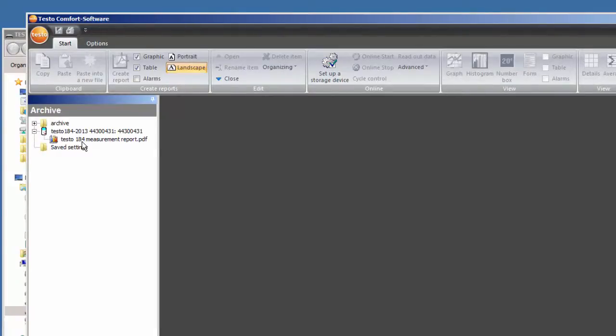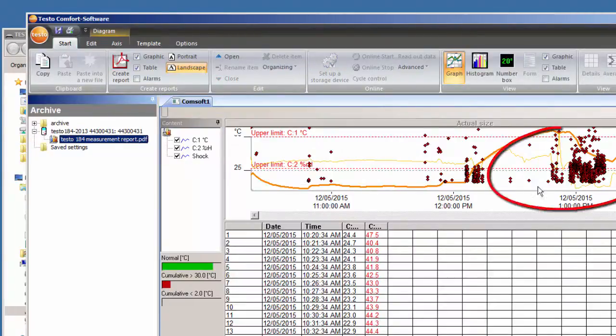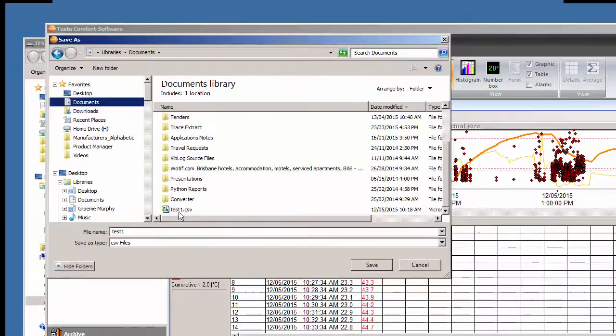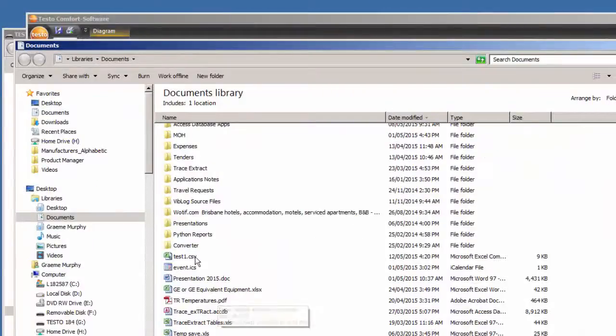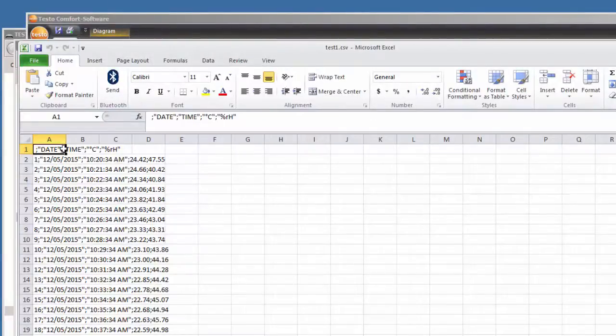Now we've run the software up. We can already see it's identified the particular logger and there's a report. If I double click, it brings up the equivalent of the PDF report — movement, temperature, humidity variations, the whole lot. Now I want to create a CSV file to see the detail. I click on the Testo button — not Start — and click Save as CSV. It opens up and asks where to save it. I'll save it as test1.csv in my Documents folder. And now we have all the detail in Excel.